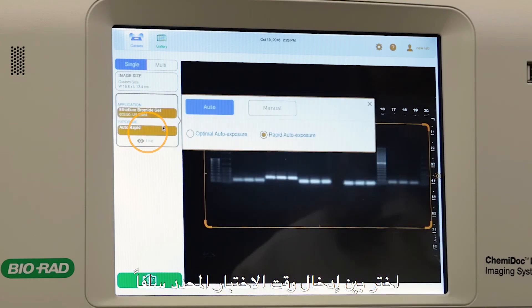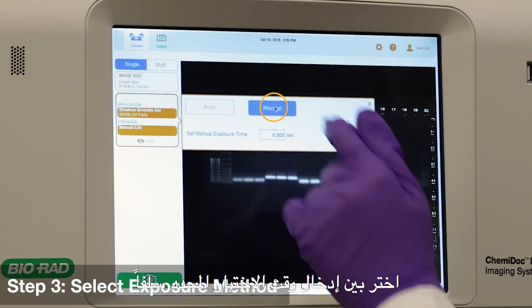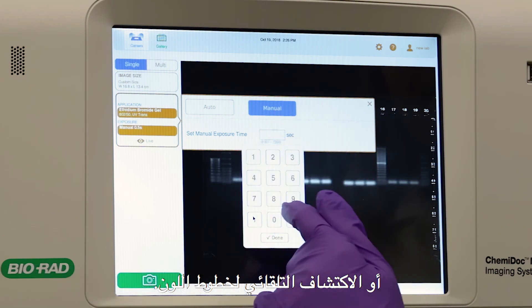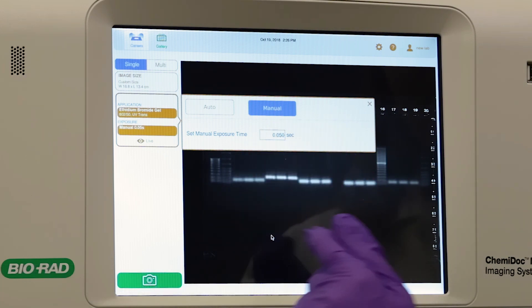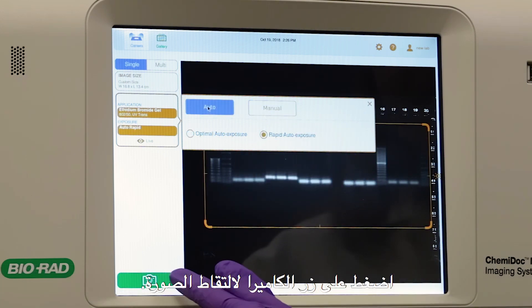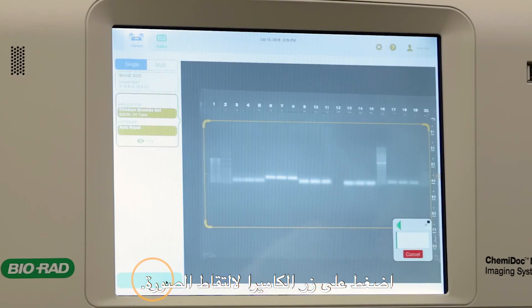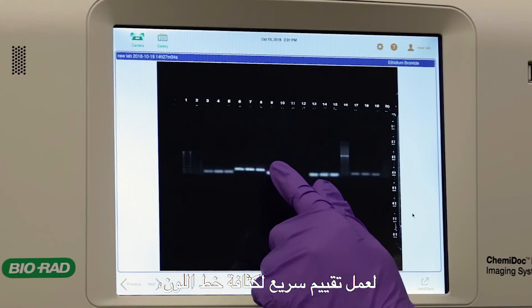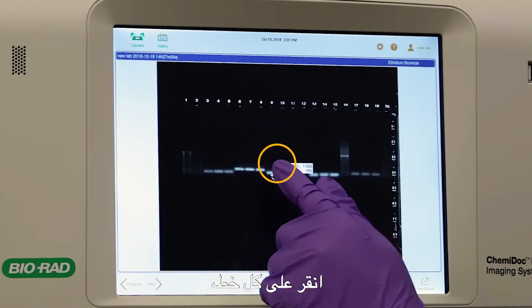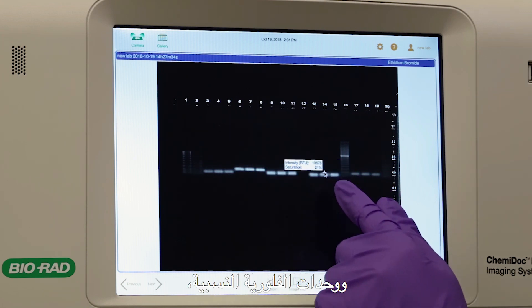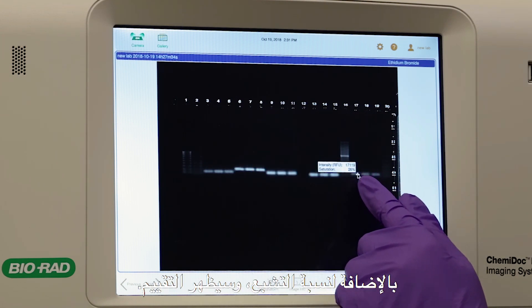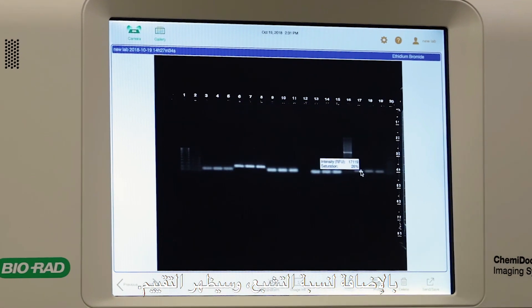Choose between entering your predetermined exposure time or automatic detection of your bands. Tap the camera button to capture the image. For a quick assessment of the band intensities, tap each band and the relative fluorescence units as well as percent to saturation will appear.